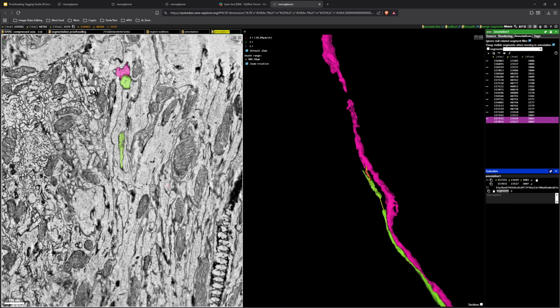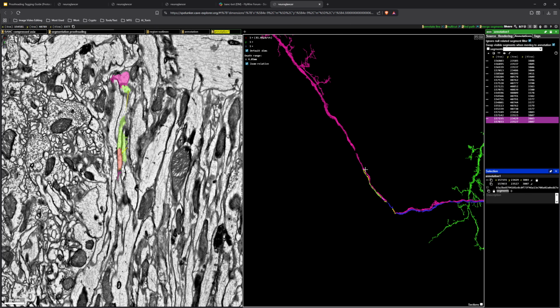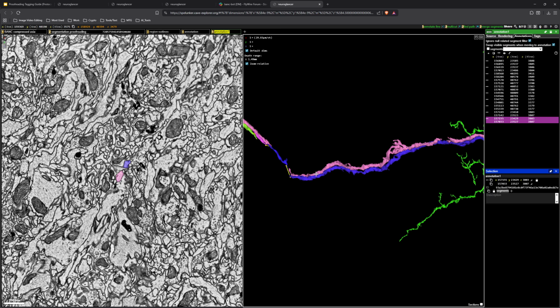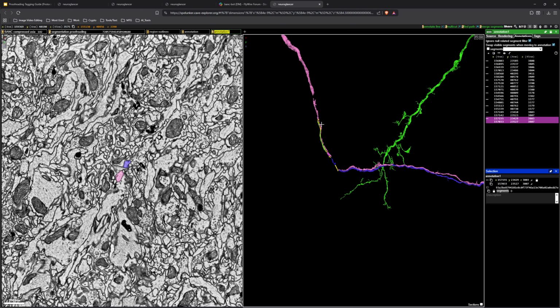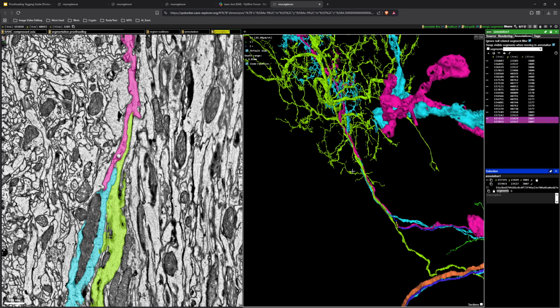So if you combine this with that, you can kind of, not exactly, but sort of visually see it's a similar thickness up here if those were merged together, right? So like if this was one thing, similar thickness, right? And it follows it all the way down, pretty intensive to find. But if what you do is similar to the other finding the soma tract, you kind of just click on things, right? The bigger ones are going to be the big guys.